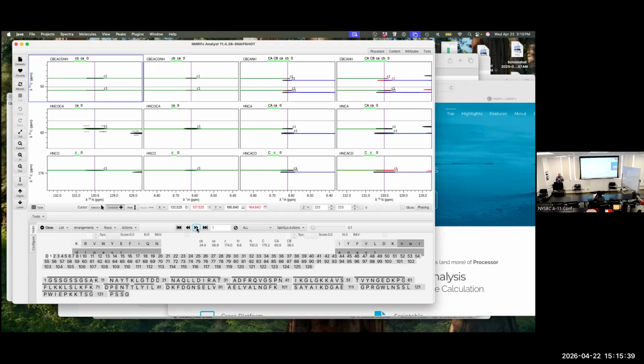So this may change. One thing that's driven us in development of this tool is that we've never tried to be fully automatic, because I've always felt that if it's fully automatic and then it fails, you're kind of left with not knowing what to do. We'd rather have a nice interactive tool and then put automation in there, but then let you fall back to the interaction. Okay.